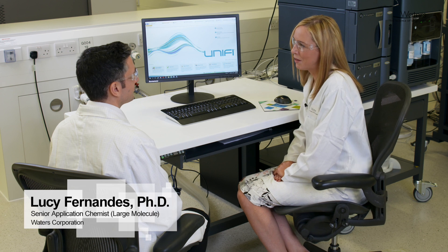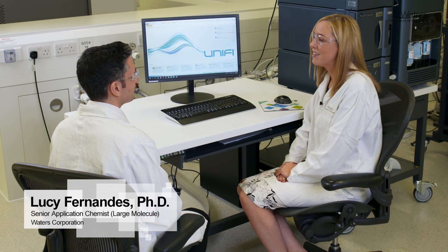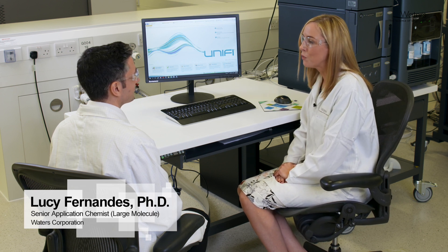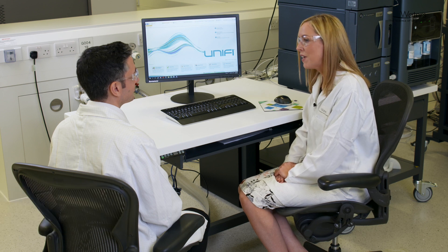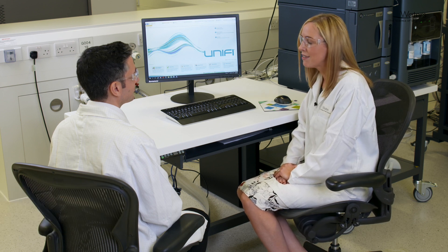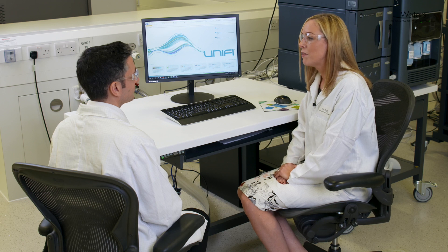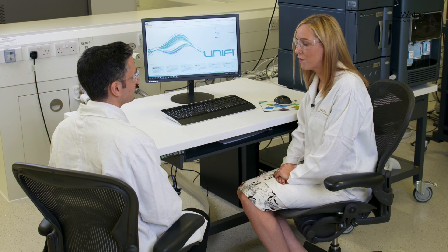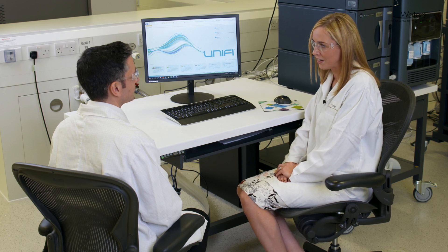Welcome to the Waters Demo Lab. Thank you for coming today. We've invited you here to demonstrate the Waters BioAccord, which is the first smart MS-enabled LC-MS system developed specifically for biopharmaceutical analysis and monitoring.